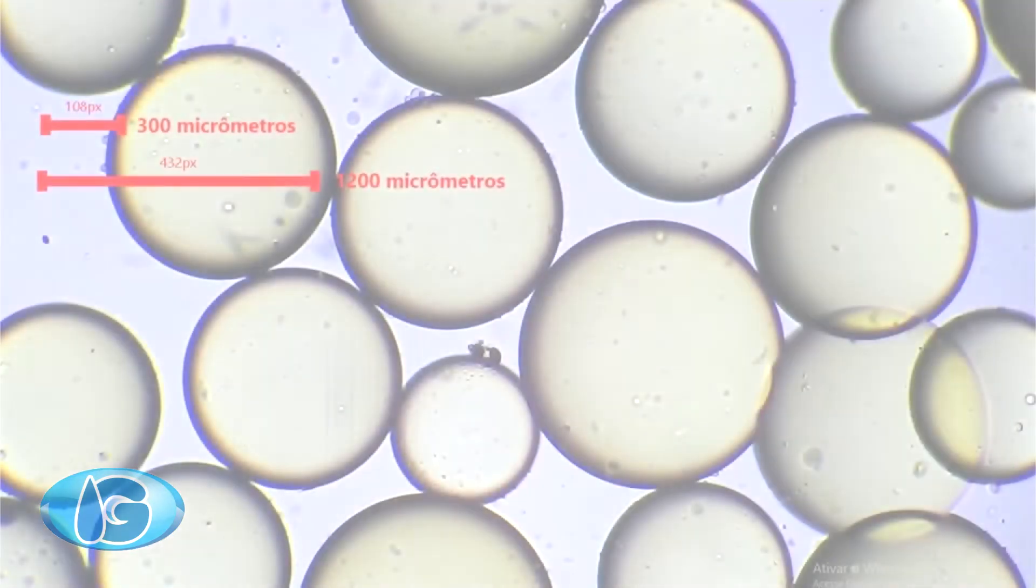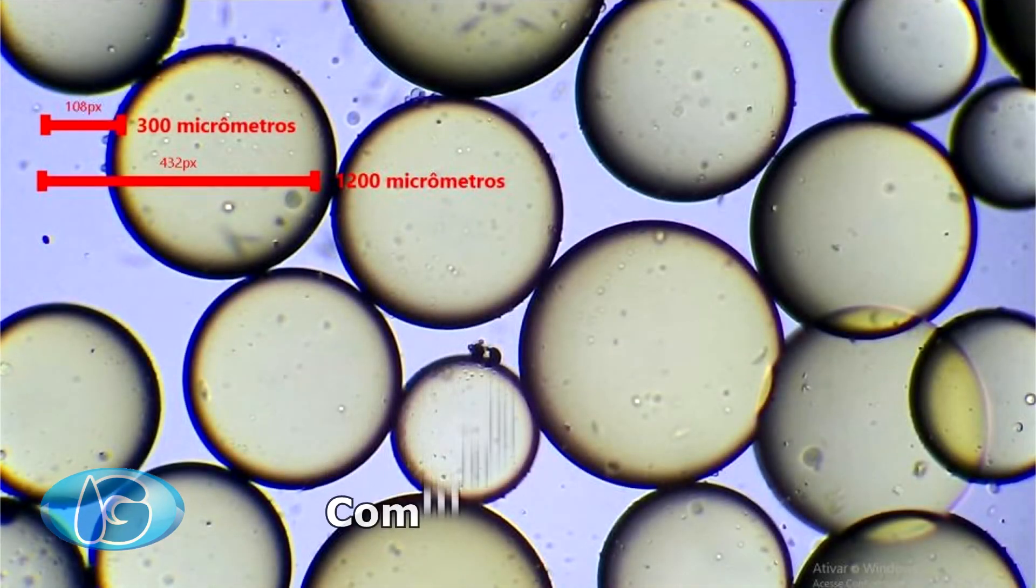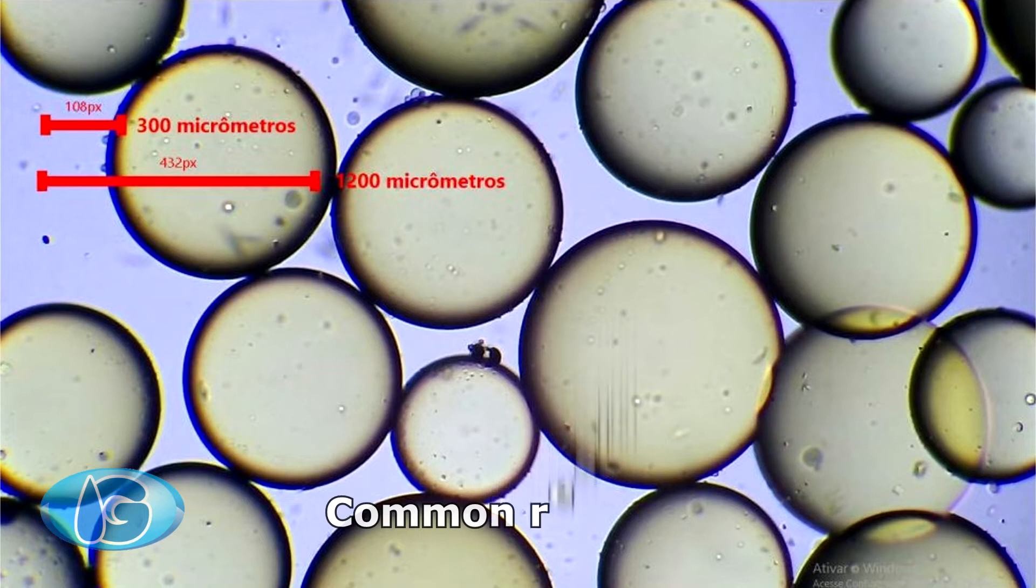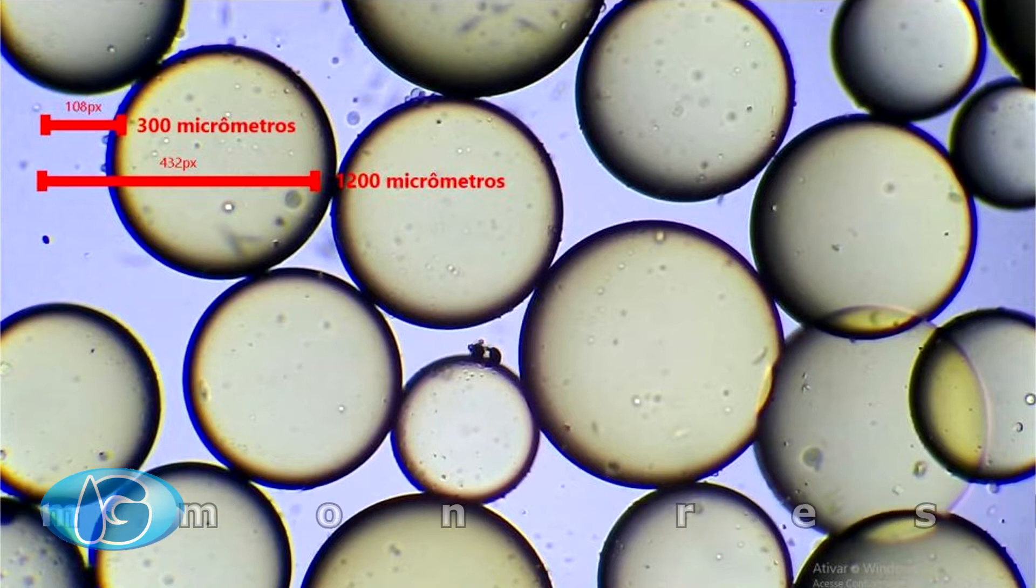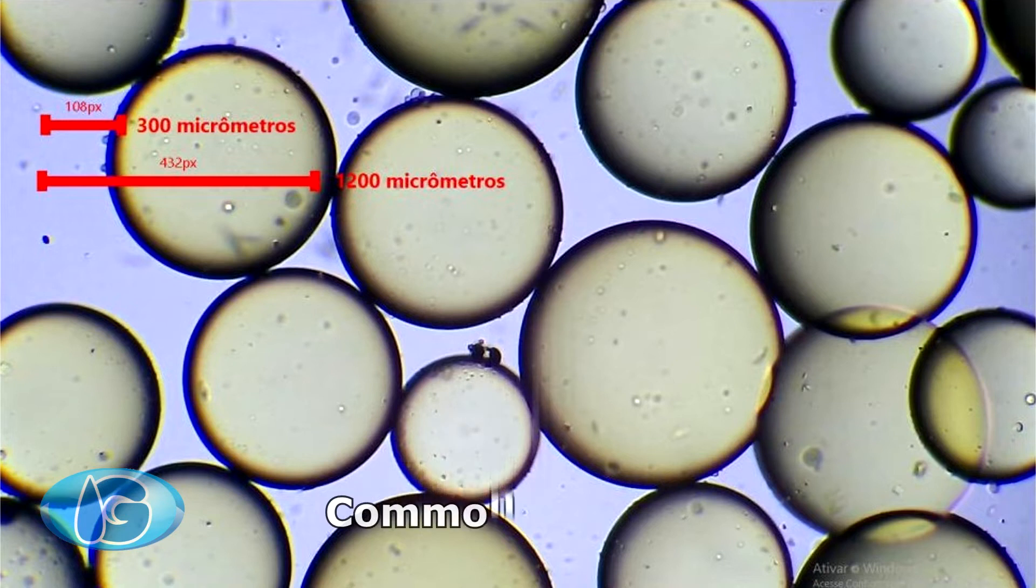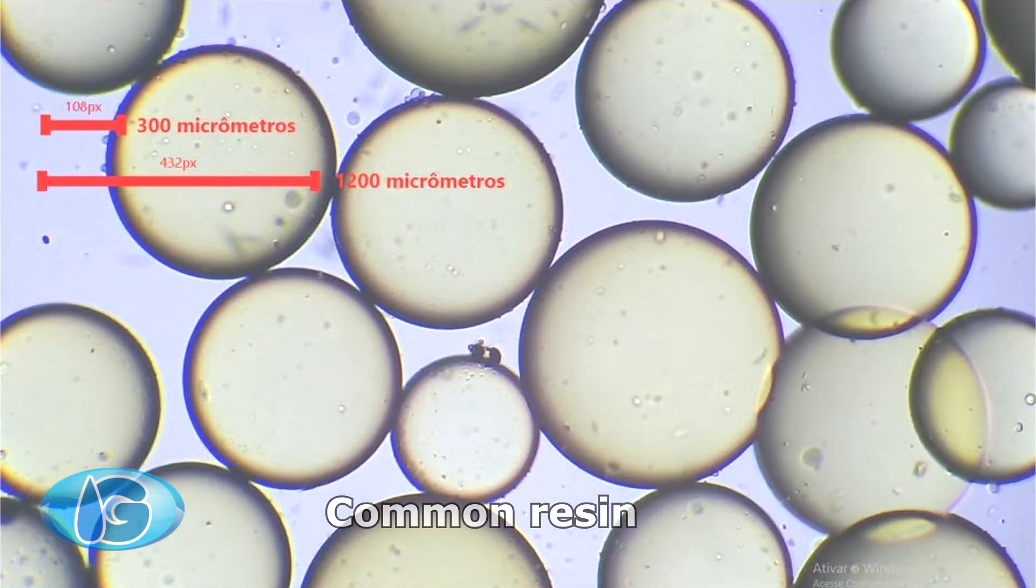We started this study showing a common SAC resin, it's a non-uniform grade, it's a common grade. You see the variation between diameters of these spheres. In this grade of resin, diameter varies between 300 micrometers and 1200 micrometers. Therefore, there is a large variance between diameters.